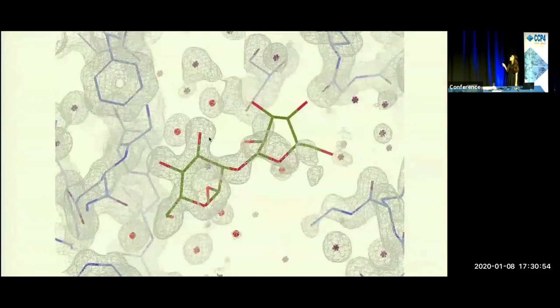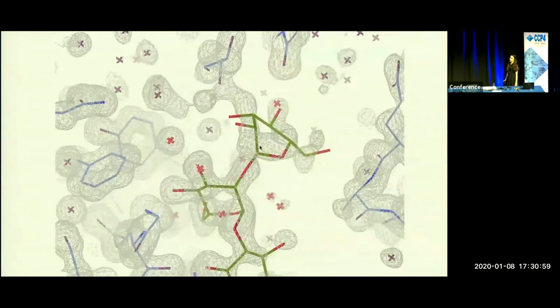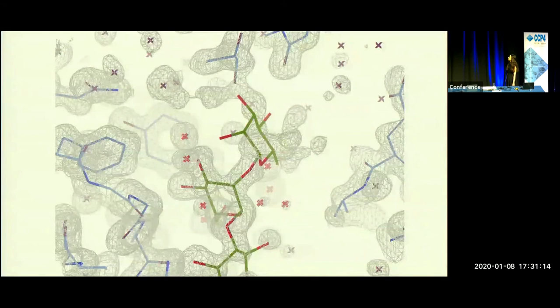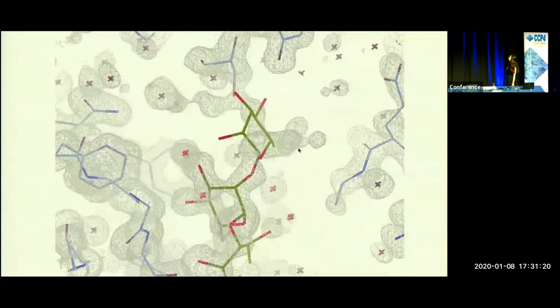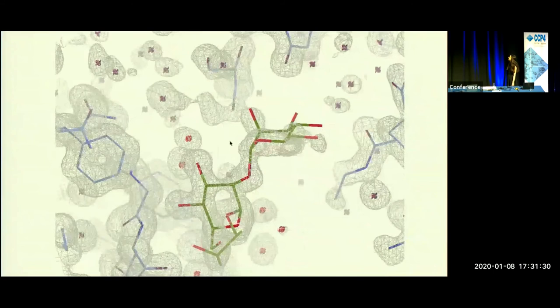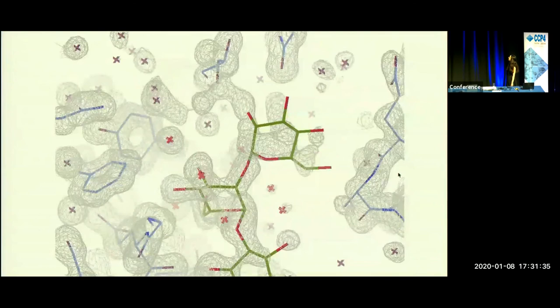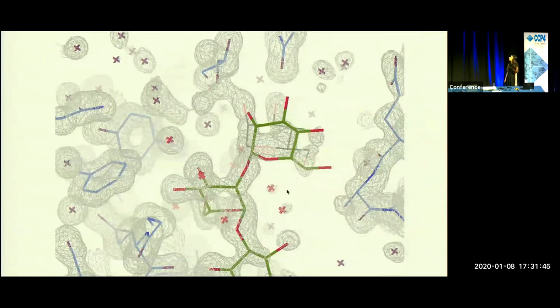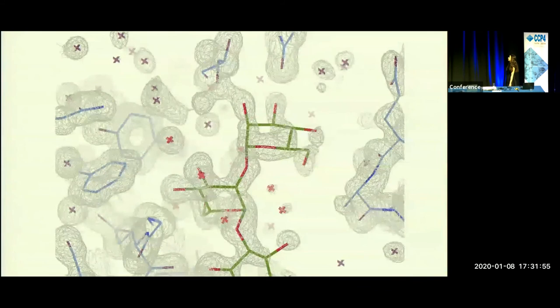Then we can run COOT. In COOT we can see that the conformation of the sugar is clearly incorrect. There is a wrongly modeled water here which is causing the error. So we delete the water, we correct the conformation, then we flip the sugar, and then we refine it with the restraints generated by Privateer. We can move this OH group to fit the electron density better, and then we accept the refinement and the sugar has now been corrected.